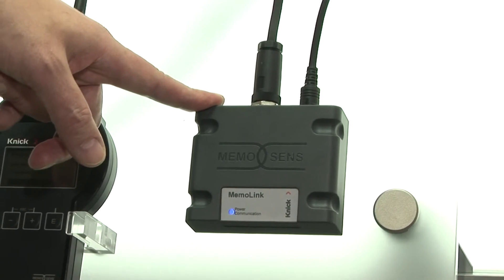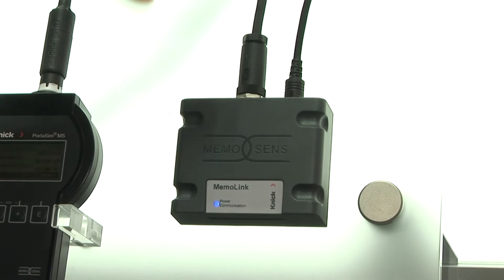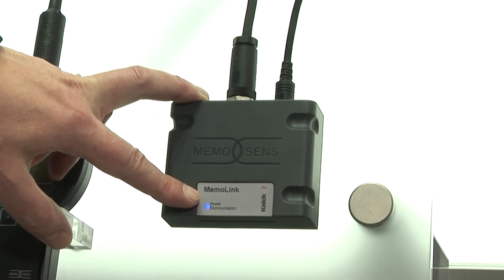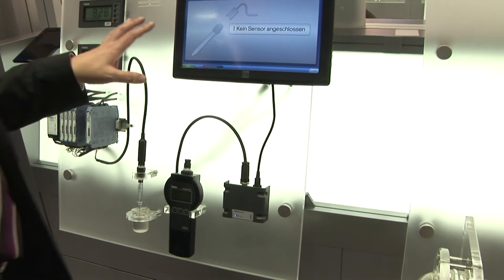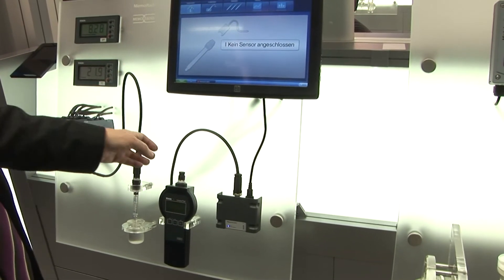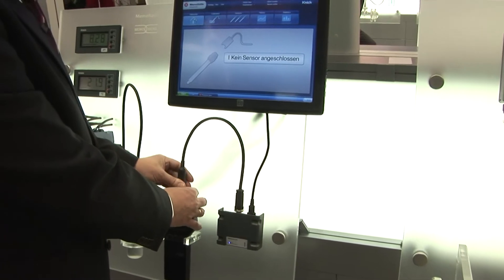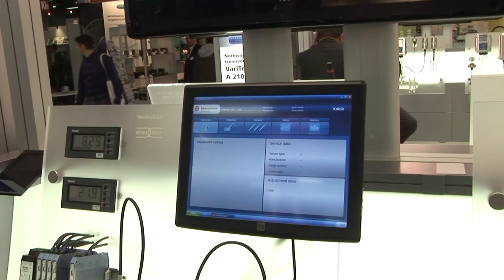MemoLink is the USB adapter from the process sensor to the PC tool. It handles signaling, powering, and communication — the blue light is twinkling on. Easy plug and play. You're in the lab and want to calibrate the measuring loop — you reconnect the sensor to the PC link and then the system recognizes the sensor.